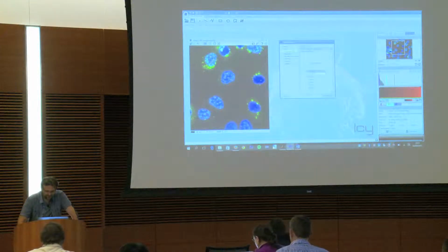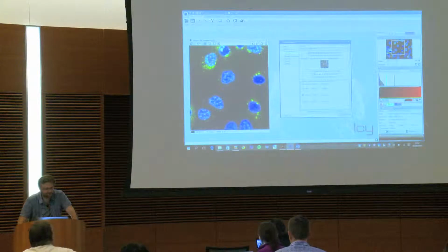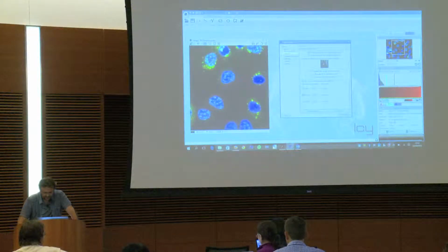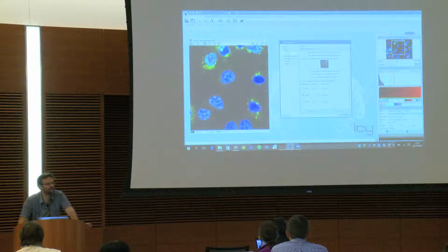And then in the pre-processing, you say that you want to find things on channel 1, that is green. Then the detector, which is here, you tell it that you want to detect a signal that is bright over a dark signal because you are in fluorescence. Here you have the scale, meaning that you want to detect a specific size of particles or spots. And here you have a sensitivity that is computed automatically. It's a wavelet adaptive threshold that is computed with the noise of the image. So that's the reason why we need the noise of the image.